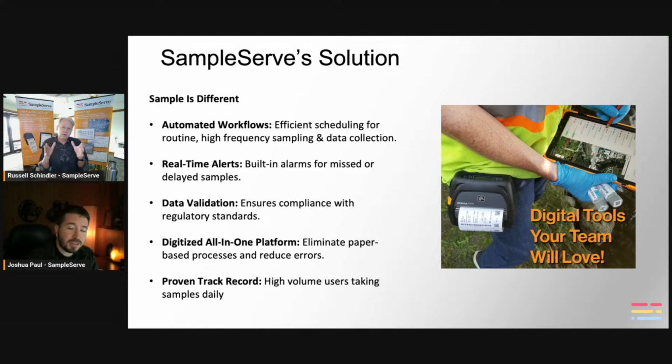And the user can put guardrails on the values of the data. So for instance, if your pH is below 5.5, you may be able to allow that, and it's up to you, but you'll get a warning. It could send a text message to somebody. Whatever the result of that outside the guardrails value that you're looking for, you're able to set that up.